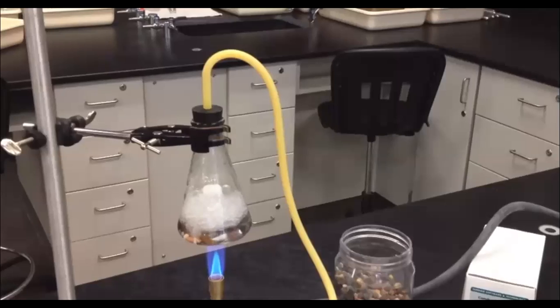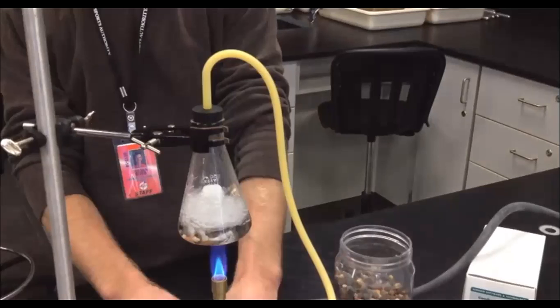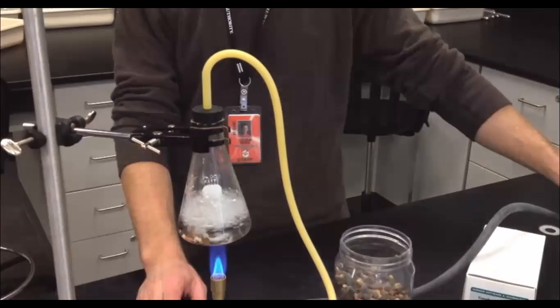So things are going pretty well. I've got a pretty good rolling boil here. Just be careful that you don't want it to boil all the way up to the rubber stopper, or you're going to start to get salt water in there. So again, you can make some minor adjustments on the flame to keep it down so that you're not going to get too hot of a boil, just a normal boil.